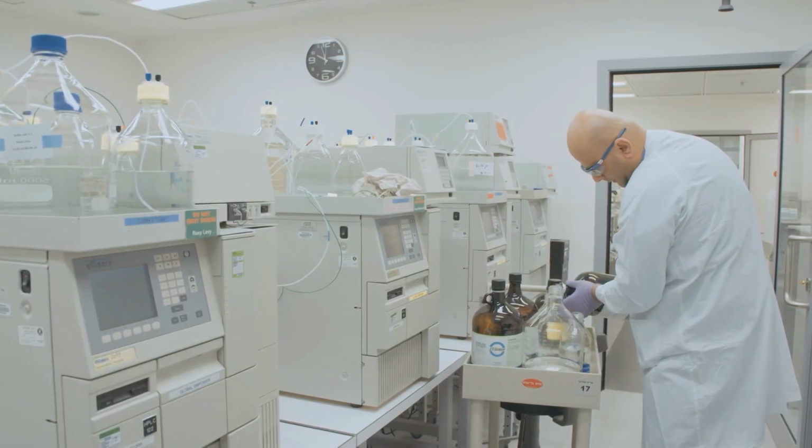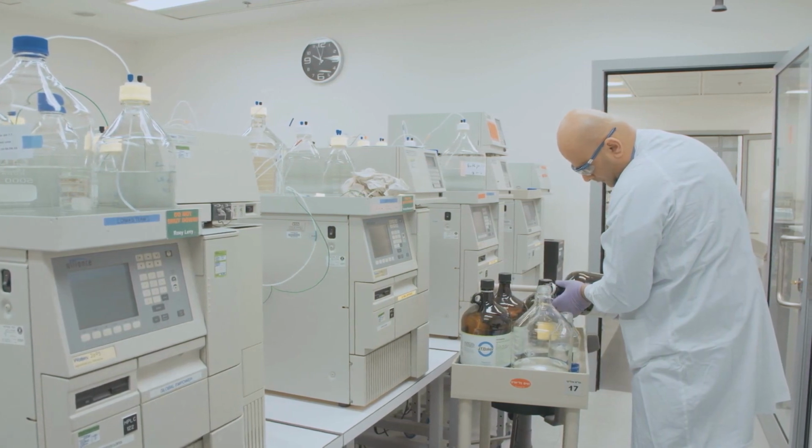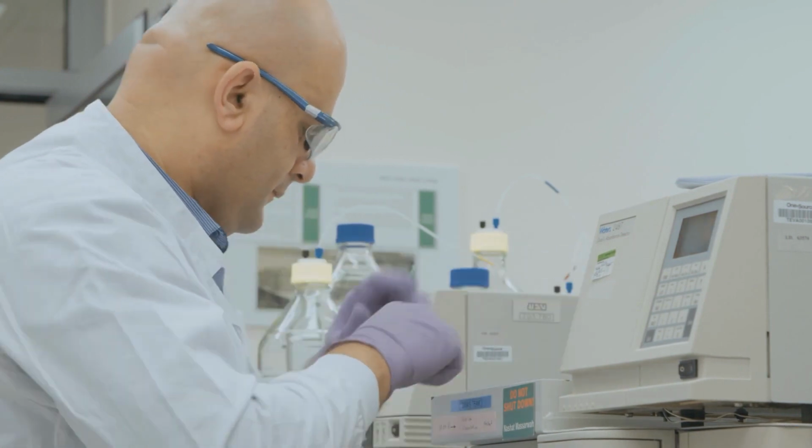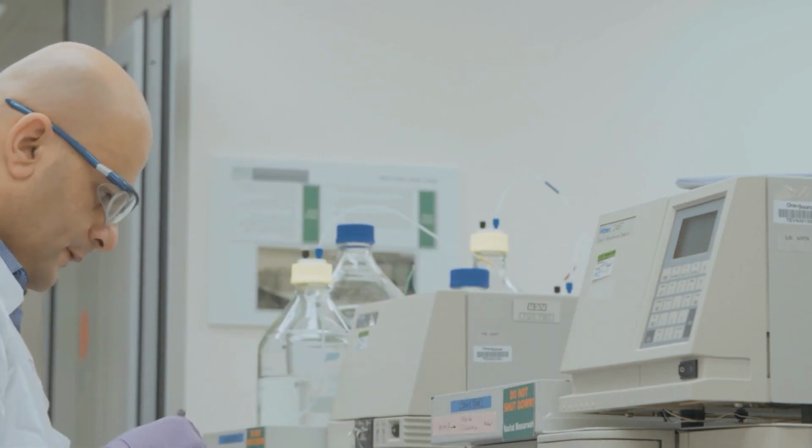Before, with mass spectrometry, we didn't have the separation yet to really define all the different glycan structures on a lipid or on a glycoprotein. But nowadays, with the higher resolution, the better separation technologies that we have, the better enrichment technologies that we have, and the better software that we have, we are now really ready to enter this field. And really, by entering it, we're almost taking it over as well, because I think any glycobiologist that didn't know mass spectrometry in the past has converted to also using mass spectrometry to analyze their problems.